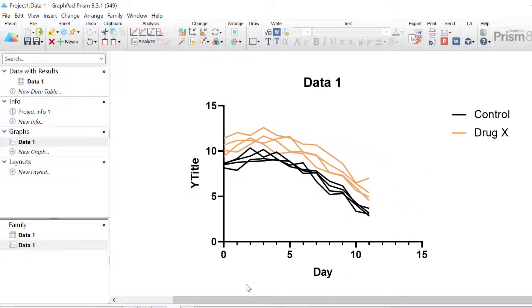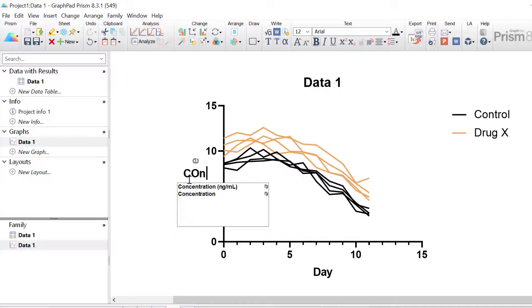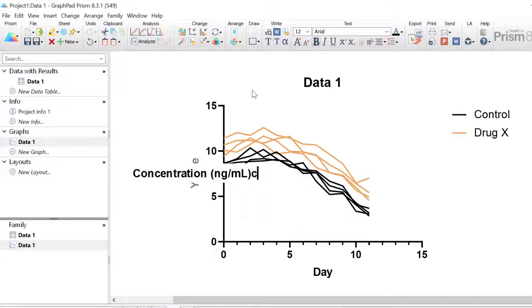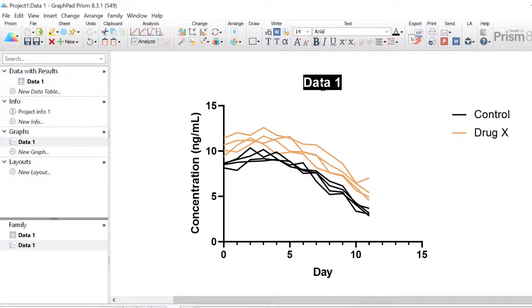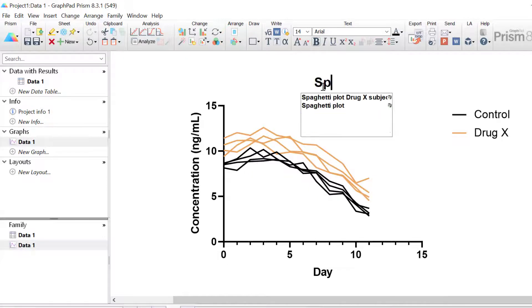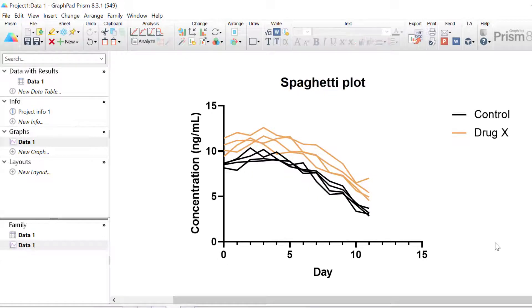The symbols have now been removed and this is looking more like a spaghetti plot. To finish this graph I will format the axis labels so that the Y axis is labelled as concentration in nanograms per milliliter, because this is a concentration of a certain protein in the blood. The title I'm just going to call spaghetti plot.